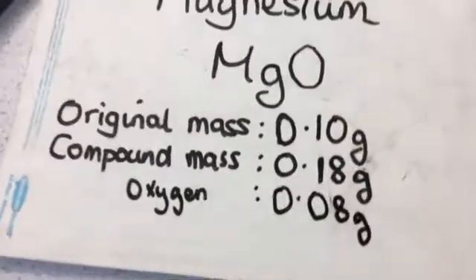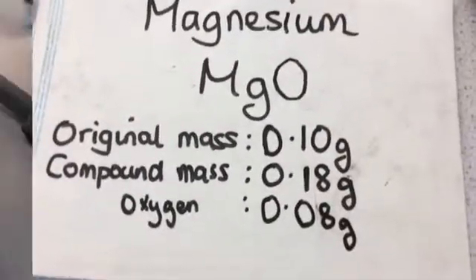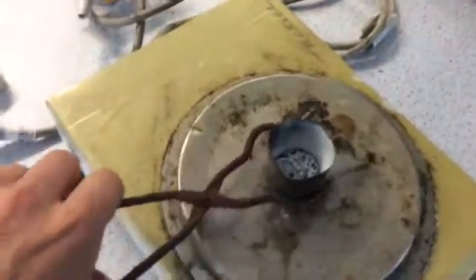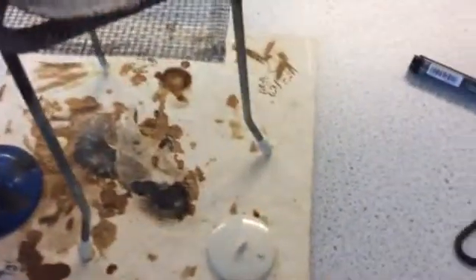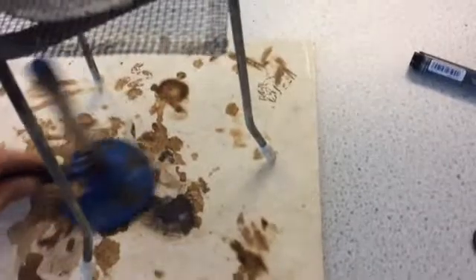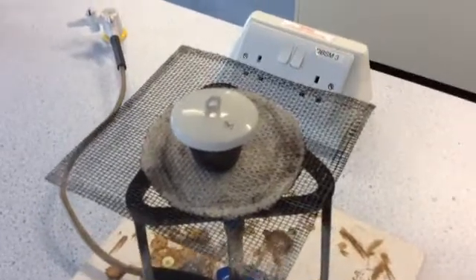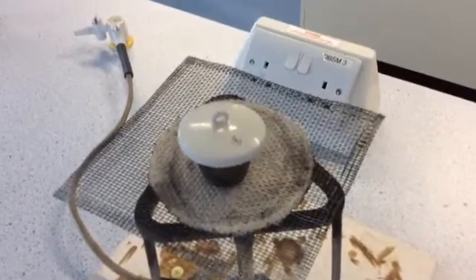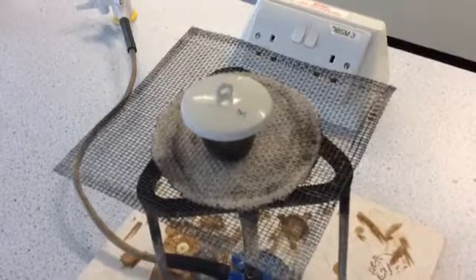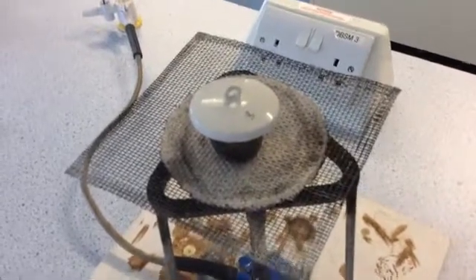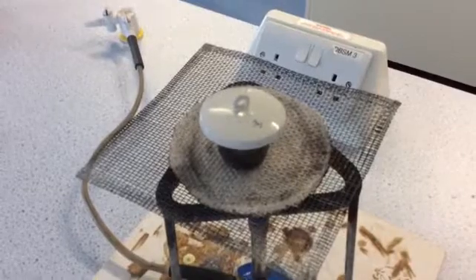Well, not 8 grams, 0.08 grams. Okay, so at this stage it's really important that I actually take this and put it back over to the Bunsen burner and reheat it. I'm just going to put the lid back on as well. Now the reason that I need to reheat it is I can't be certain that all of the magnesium has reacted. So what I need to do is I need to reheat it and then re-weigh it. So I'm just going to leave it to heat for a little while longer.